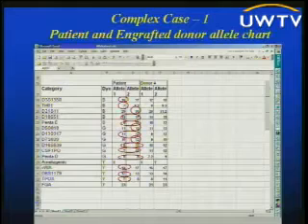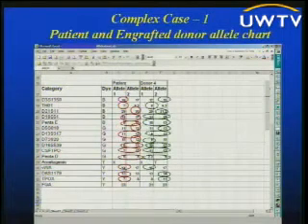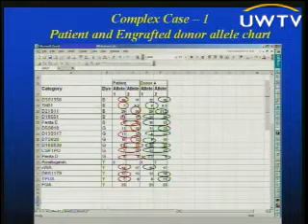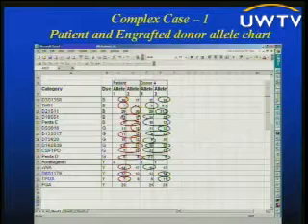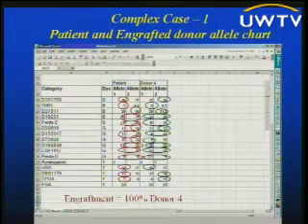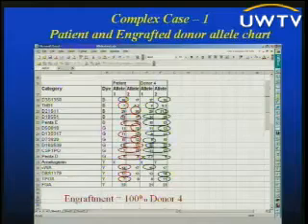So it was a very simple matter actually to find informative loci here, because it was a single donor, single recipient pair, we're looking at multiple alleles, multiple loci that one could use, and multiple alleles that were informative, allowing us to say that engraftment was essentially 100% with the donor we designated donor for.